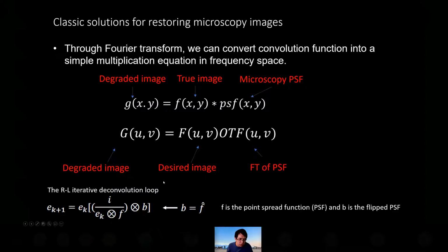However, in order to get deconvolution to work great for microscope images, you have to have very good knowledge of the point spread function. On the one hand, the point spread function changes at different z depths when you're imaging the sample. On the other hand, when you acquire the image, if your signal is not bright enough, the signal is typically contaminated by Gaussian and Poisson noise. And those two factors together contribute significantly to getting a very good deconvolution.